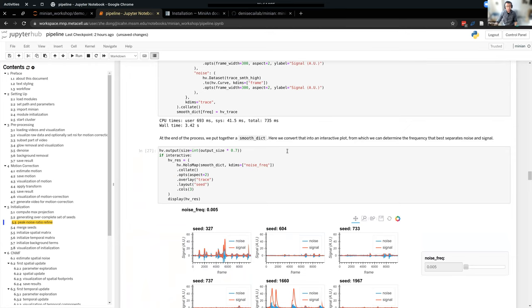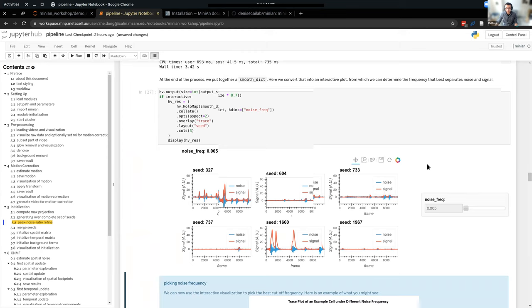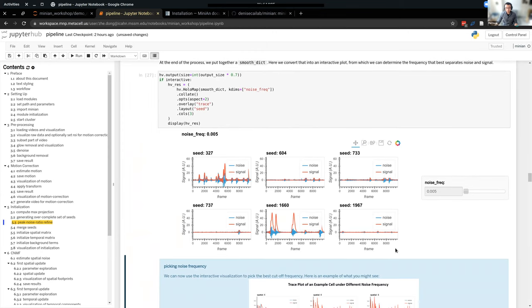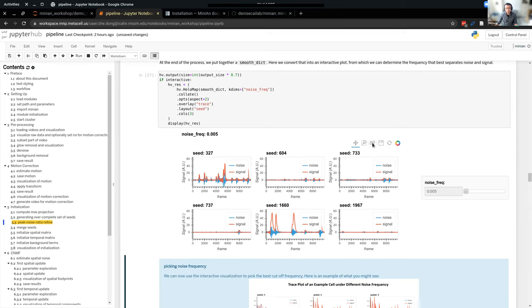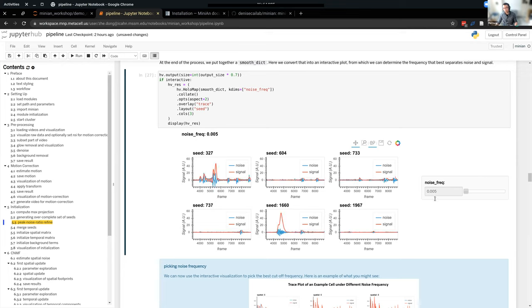The most important parameter to choose in this step is the cutoff frequency to split these two frequency components. This parameter is not only used here — it's also critical to many other steps, including downstream CNMF. You want to use this visualization to determine a single value for the noise frequency and use it consistently across all steps. Let's go ahead and run the two cells up to the blue box.